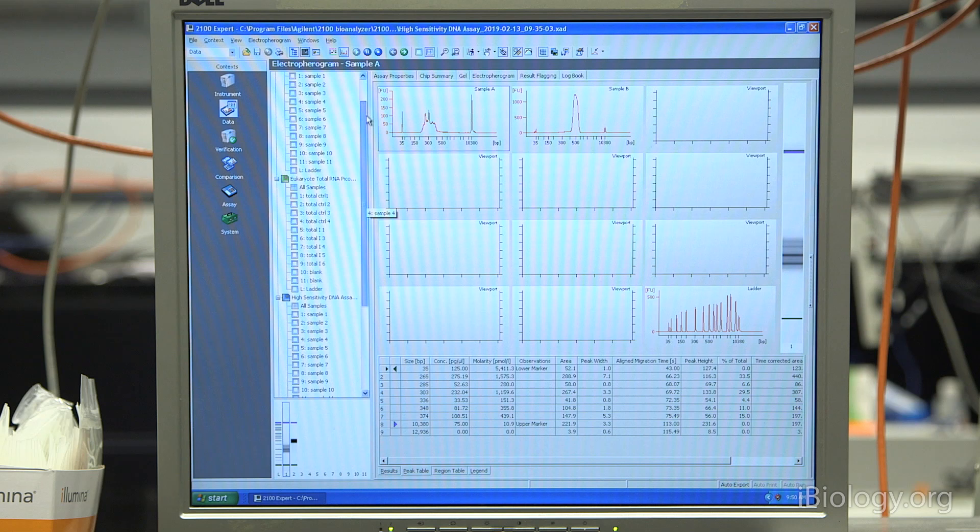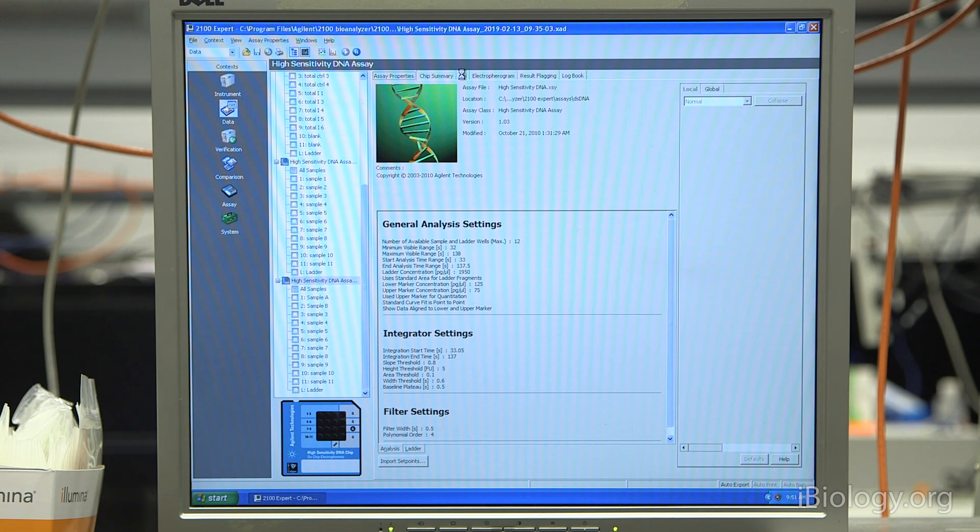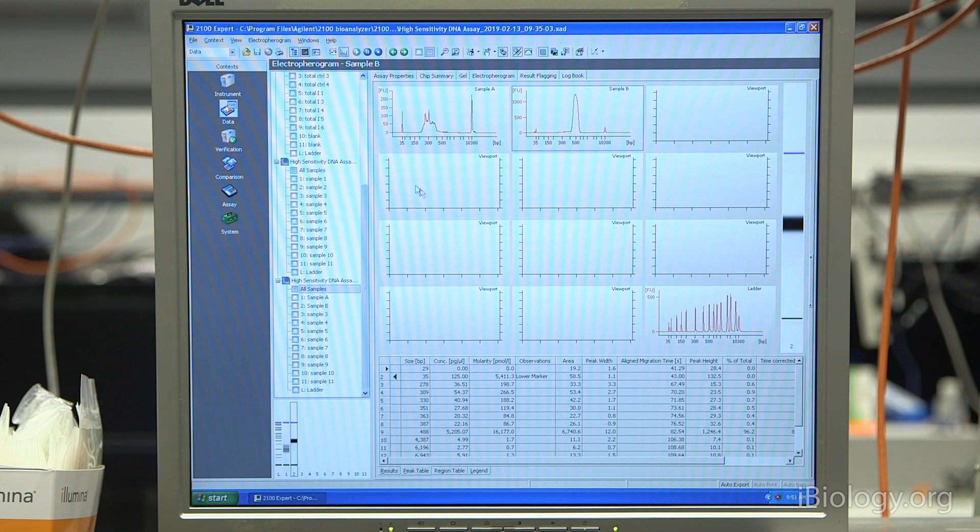If you have several runs from beforehand, you'll see the other chips here. The newest one will be at the bottom, which is our sample. If we click on that chip, we'll get some details about the chip, the assay properties, and then if you want to take a look at the raw traces, you click on the electropherogram. This will show you the trace for either one sample at a time, so this is our first sample, and this was our second sample. Or you can look at all samples at once. Here's sample A and sample B. And down here is the ladder.